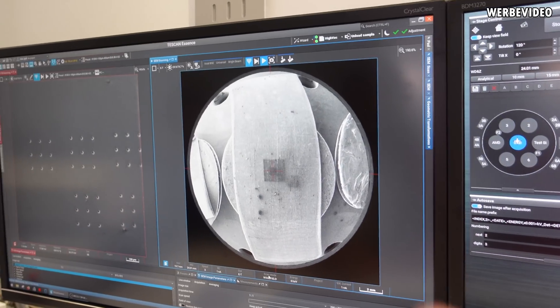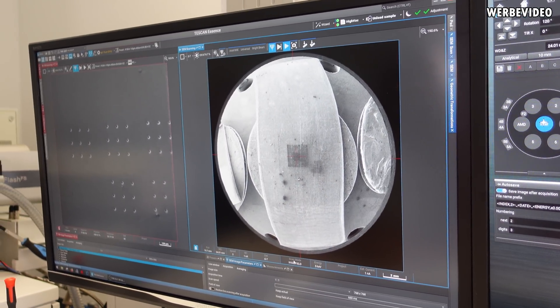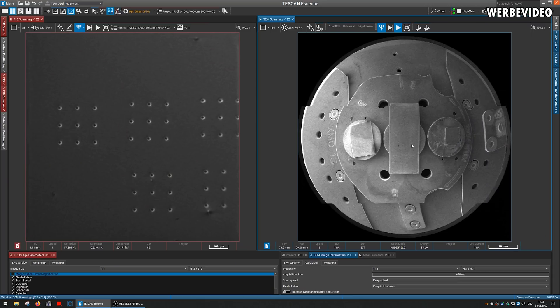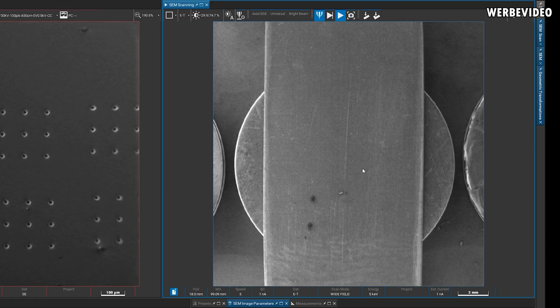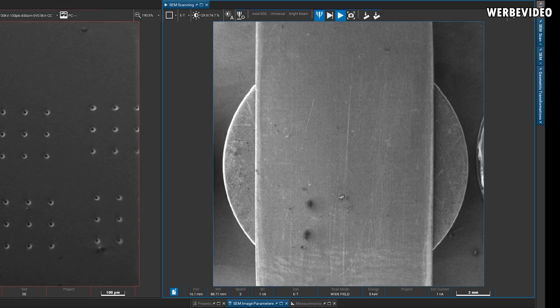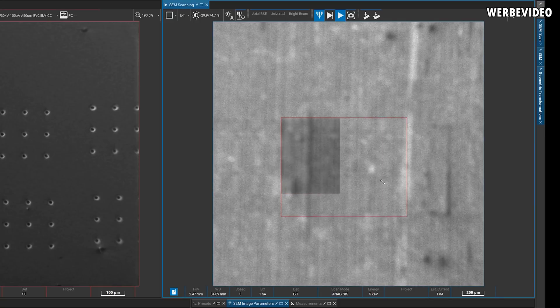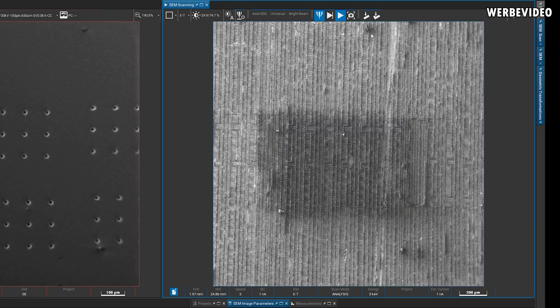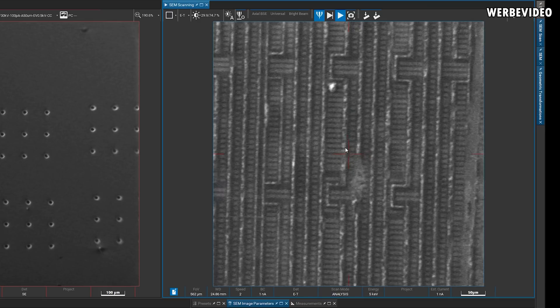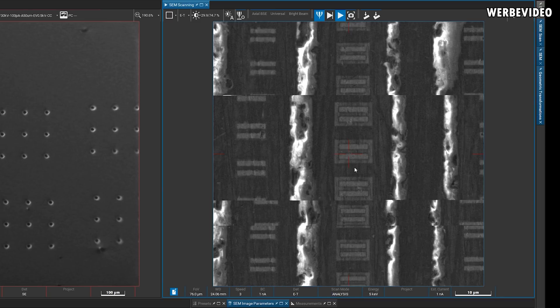Starting off with the 10900K — you can see some particles left from the lapping process. Now we're starting to zoom in. With the naked eye you'd already see some structure from reflected light, but with the electron microscope you can't see anything at low magnification. As we zoom in more, structures become visible. Those are not traces but interconnects between layers, and the lighter areas are copper interconnects between different layers.